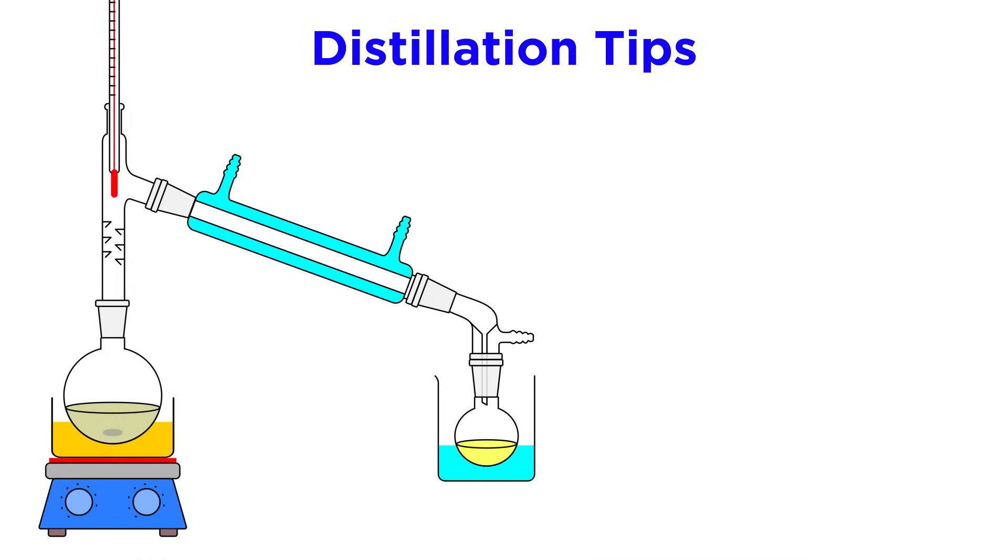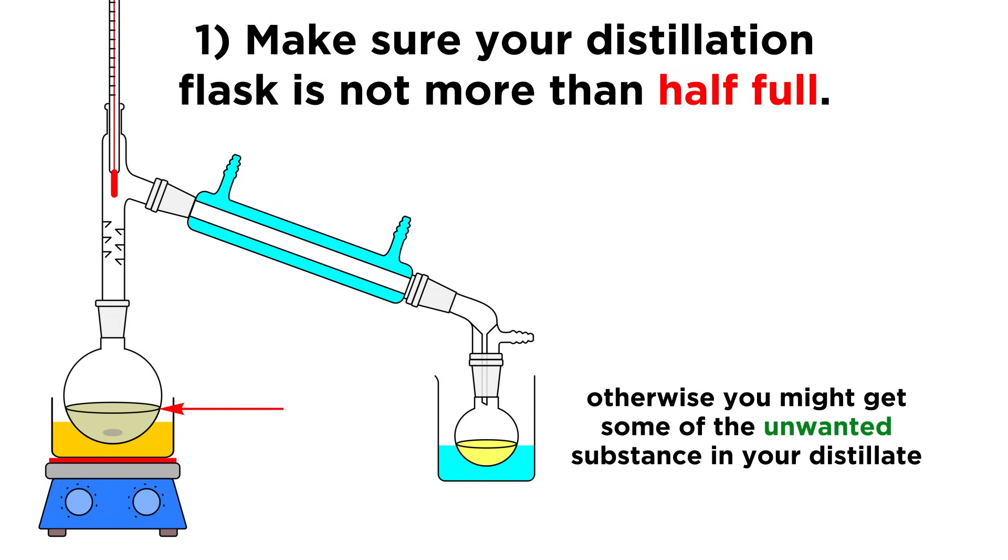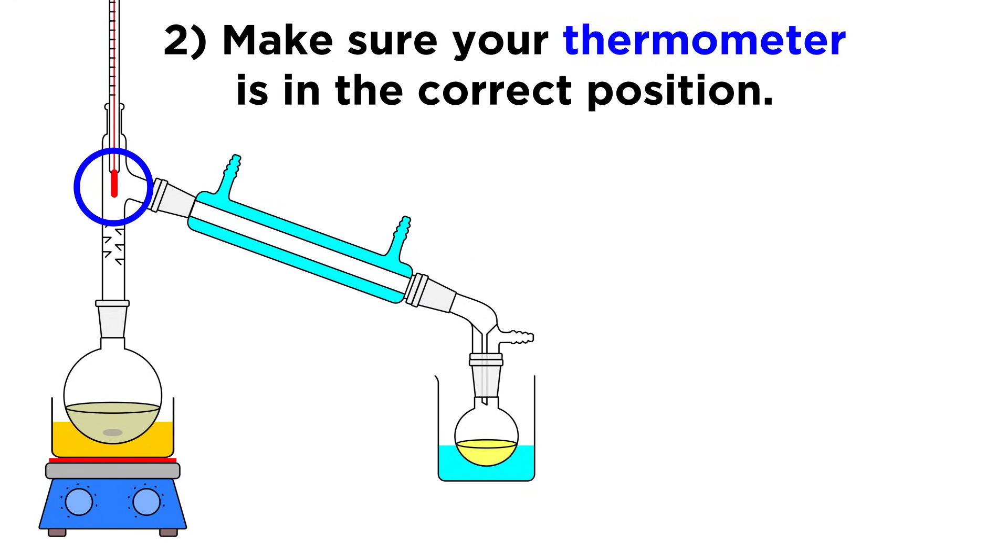Now let's mention a few quick tips to make sure your distillation goes smoothly. First, make sure your distillation flask is not more than half full. If it is too full, some of the unwanted substance might make it into the distillate. Second, make sure your thermometer is in the right position, up here, as we want to measure the temperature of the vapor, not the liquid.